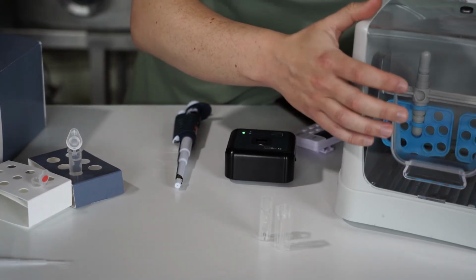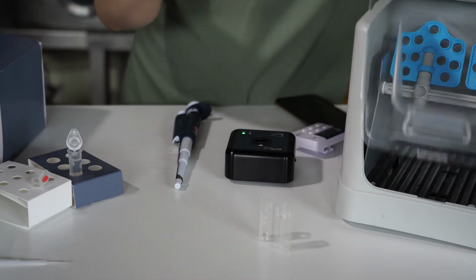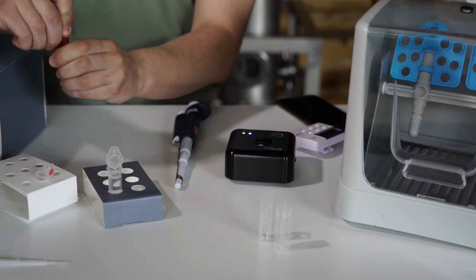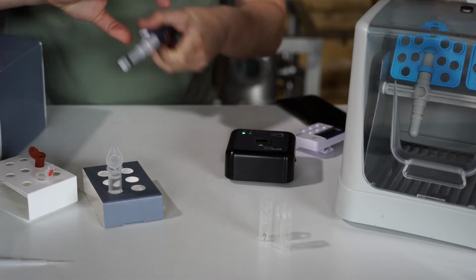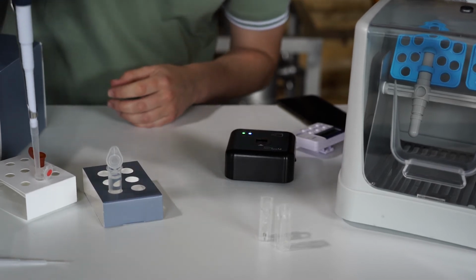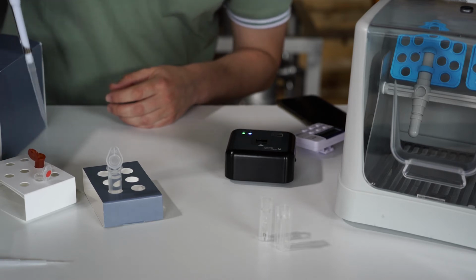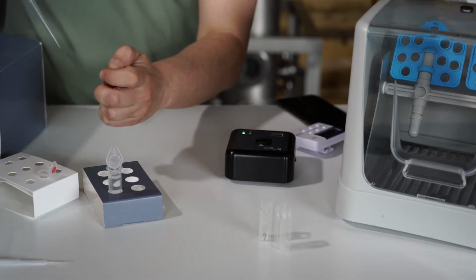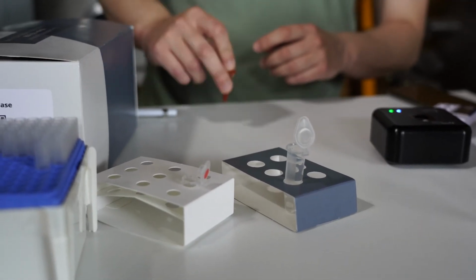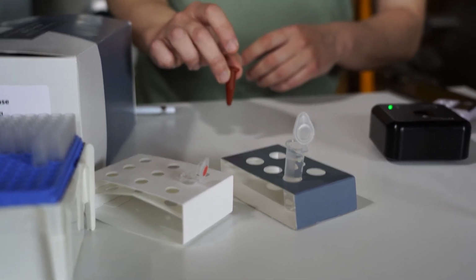So after the 7 minutes, you take the tube out from the heated incubator, you place it here, and as quick as you can, you add the stopping reagent. Again, 250 microliters of stopping reagent. Close it. What you need to do is mix again for around 5 seconds, and that is ready to be read in the spectrophotometer.